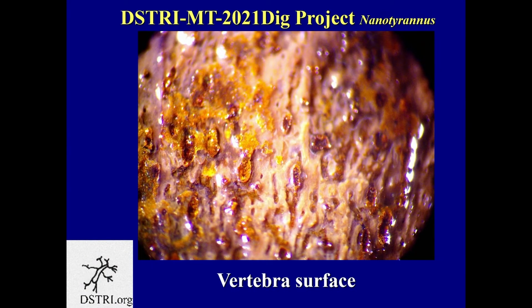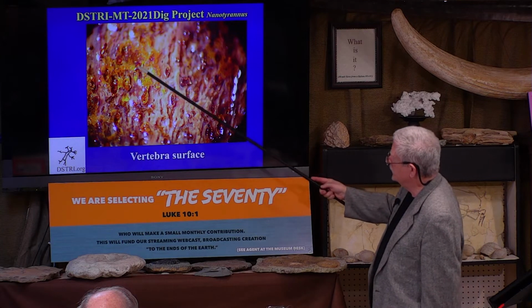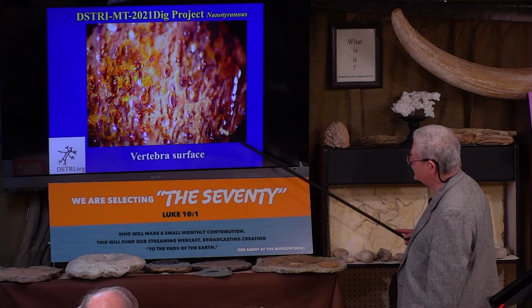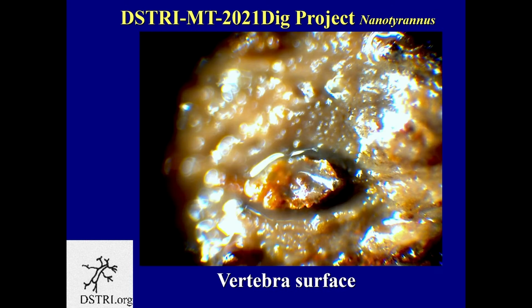And it exposed the layer of compact bone just below the outer shaft of bone, and you can see all of these Haversian blood canals in here. So these are the blood canals where the blood vessels travel. Every single one of them is clotted. And that's at the surface. We haven't even gotten into the interior of the bone yet, right? So this is systemic clotting all the way to the edge of the bone. So that was pretty exciting.